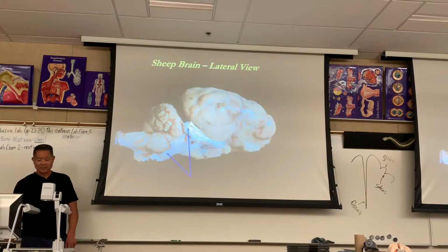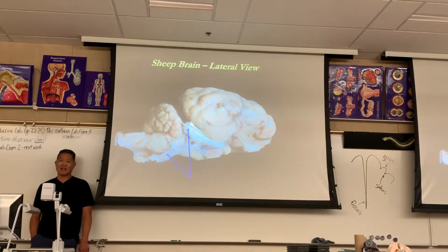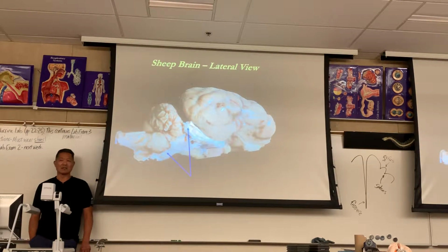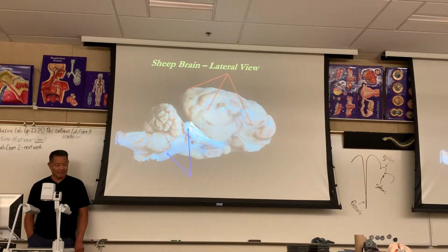Okay. All right, this is sheep brain. This is showing you some dura mater. The dura mater is like a thin sheet of leather. It's pretty thick. It's tough, but it's actually just physically thin. It's just a thin leather-like layer, dura mater. What's actually stuck on the brain there, the orange arrow, is pia mater.